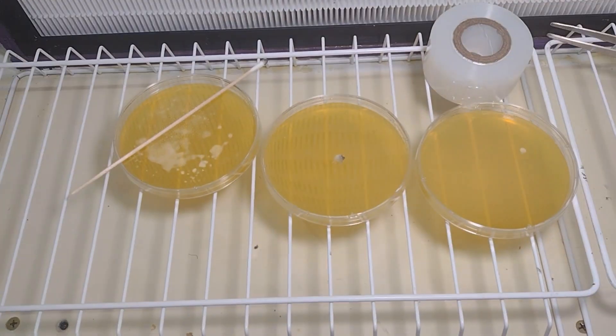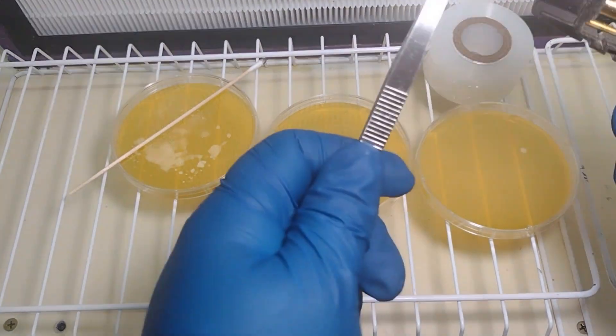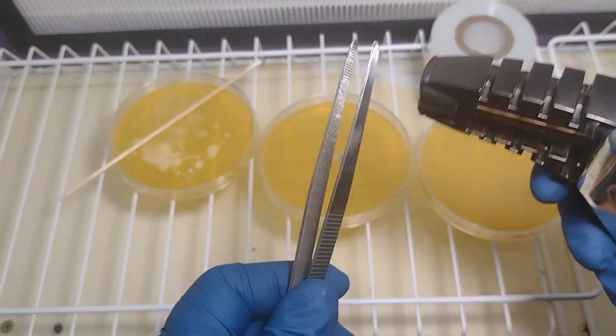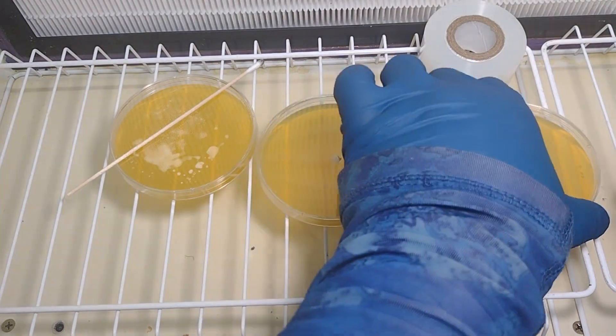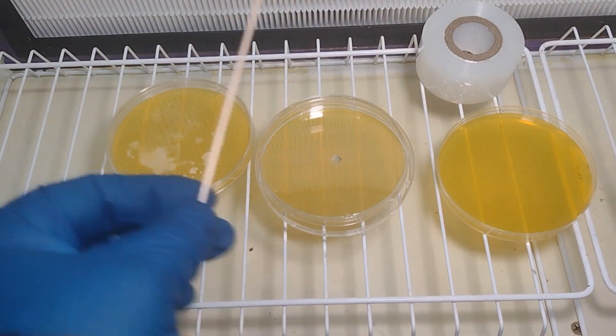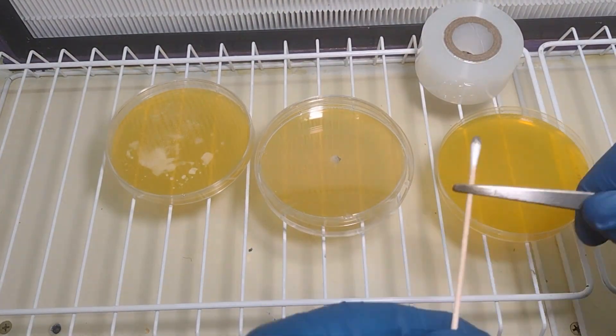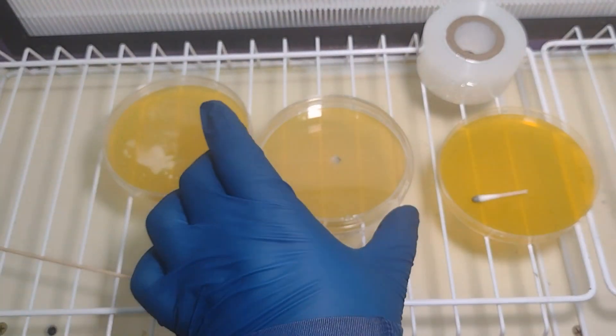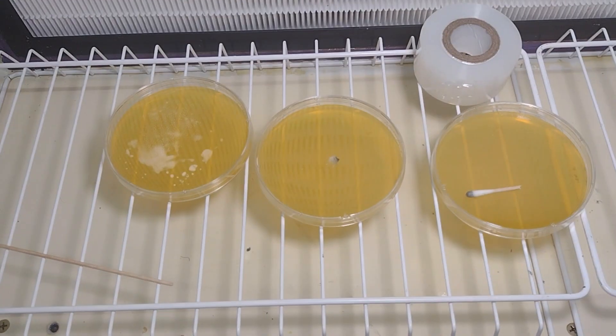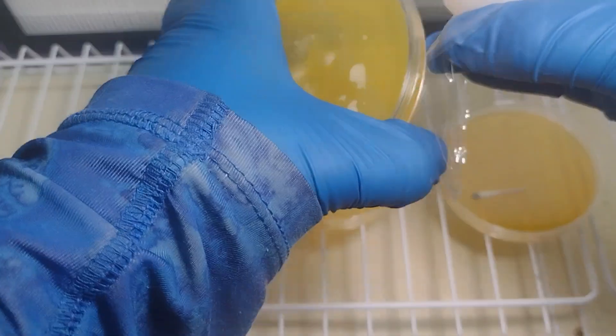Now we have one swab left. I'm going to bring out these thicker pair of tweezers, sterilize them with the torch, and hold this closer to the head of the swab and break it off. You'll notice that I forgot to pull the grafting tape out of this shot — so if you have a flow hood, don't put anything in front of your agar plates. But anyways, that's how you break the tip off.